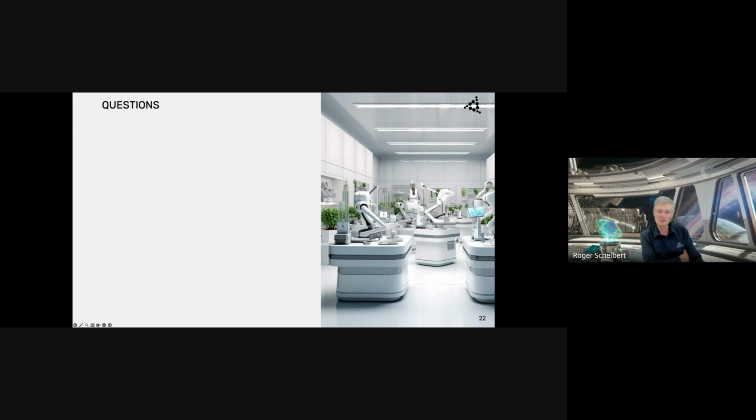So it's not required, but in certain cases, if you want to have new systems trained in, then for sure the equipment and devices have to be integrated into the software part first. But as soon as the devices are in, it's no longer necessary to have engineers or robotic experts.